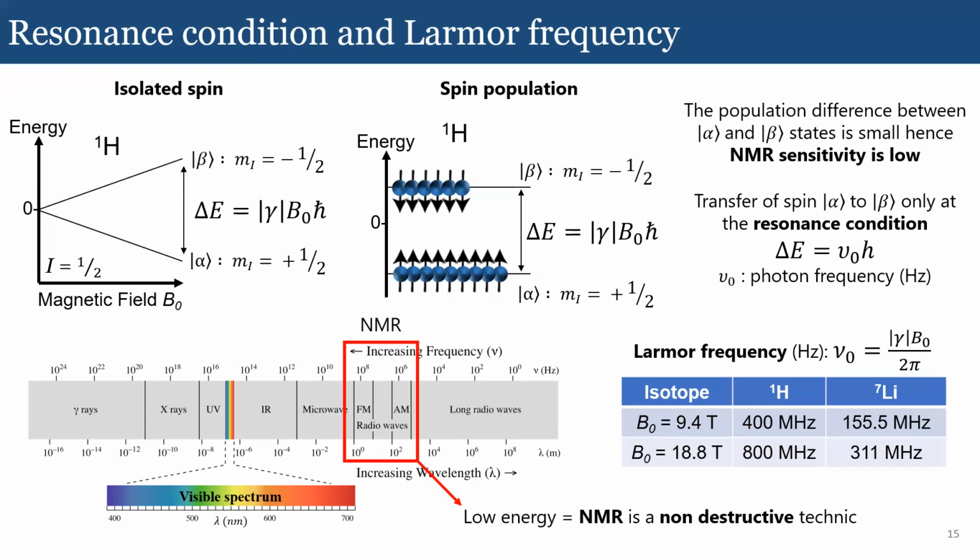If you take, for example, infrared spectroscopy, this type of population difference is much higher. You have lots of molecules in the ground state, and that's why infrared spectroscopy is quite sensitive: you can just put some infrared light on your sample, excite this transition to a higher state, and then look at your infrared signal.